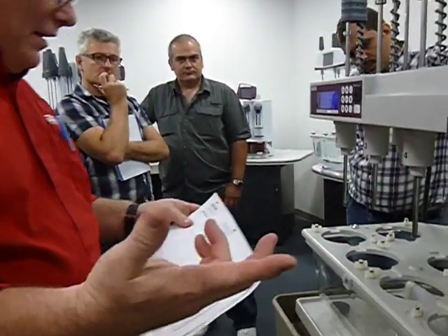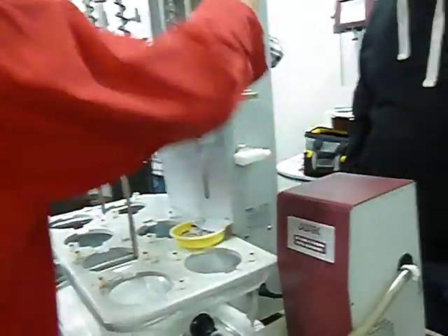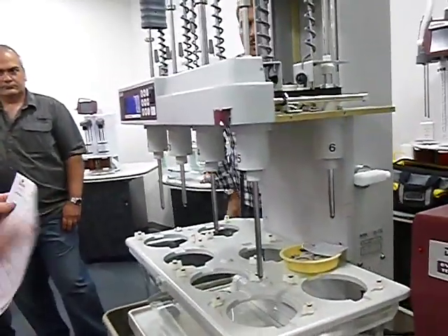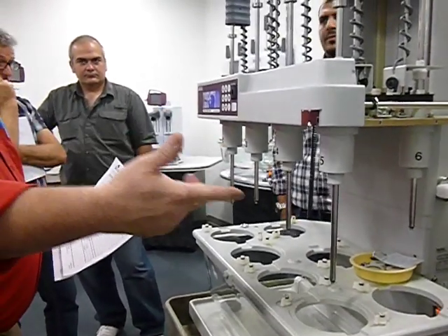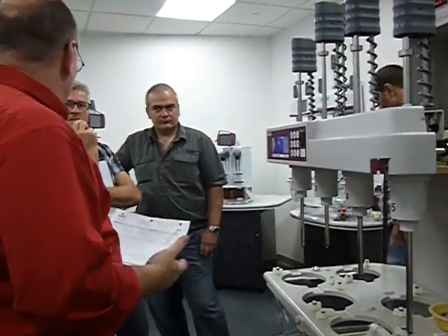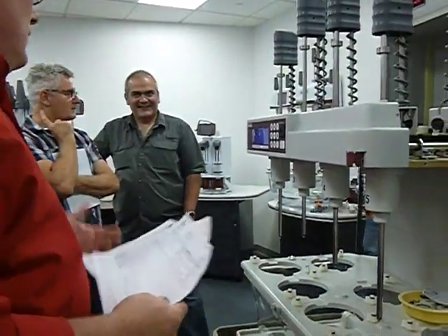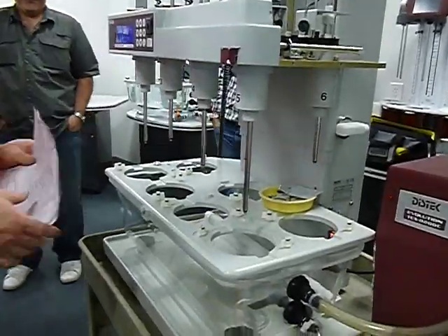Inspection of the fittings, hoses, and connections. Inspection of the electrical connections, which is the connection between this and the main unit, which is a 485 cable, and your power cables, just to make sure they're not frayed, not pulling out anywhere. And clean the TCS, meaning opening it up like we did the front one up there, blow out any contaminants that you see inside. A lot of times you get a lot of dust inside of it, little dust bunnies and stuff. Anything, all kinds of stuff. Wipe it down and blow it out. Depends on the lab you go to too.